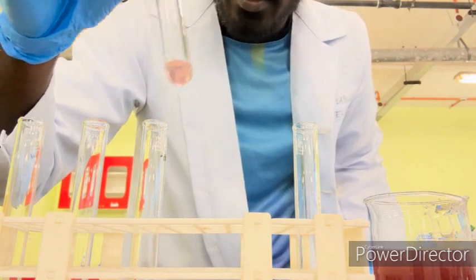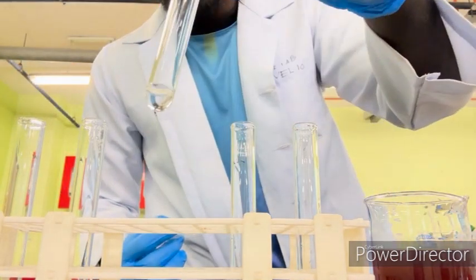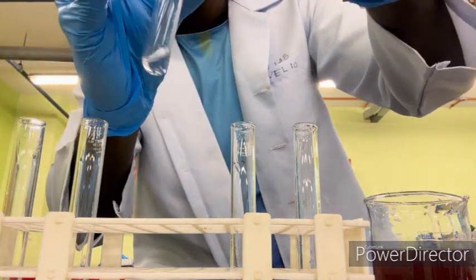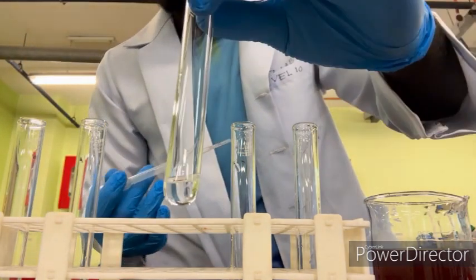And for third one, I'm going to add the onion peel extraction to HCl chemical.